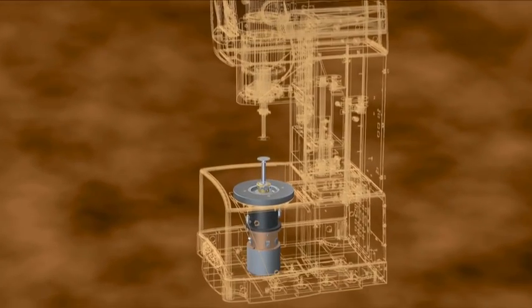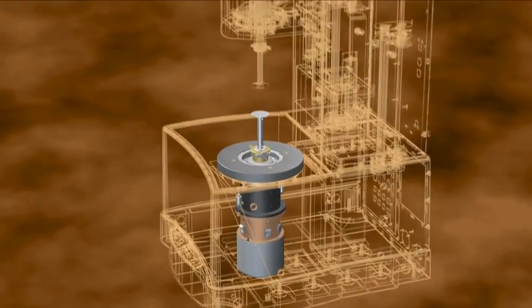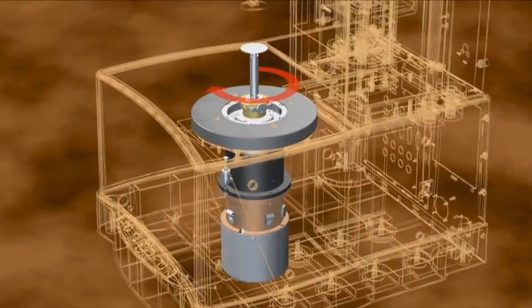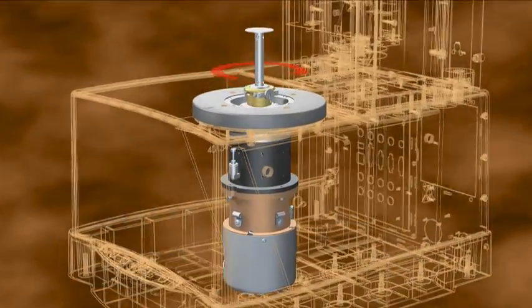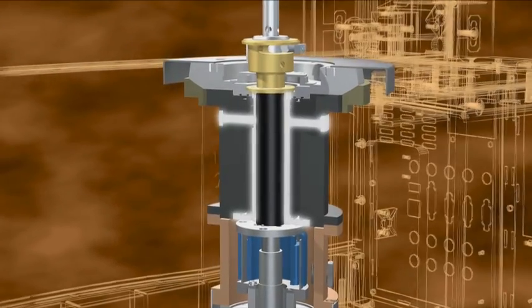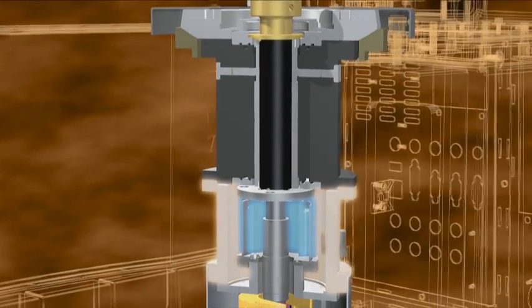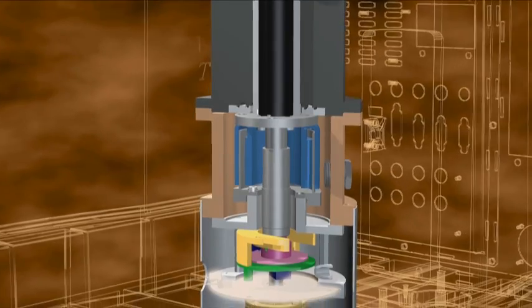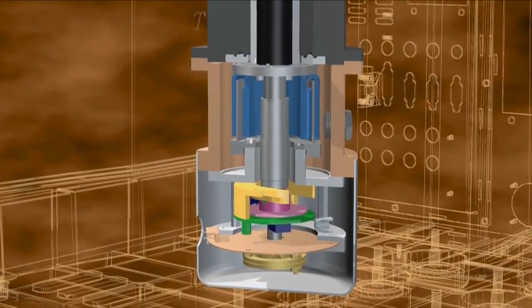The ARES G2 drive motor delivers the most accurate frictionless rotational motion over wide ranges of angular displacements and speeds. Key design components include air bearings, a brushless DC motor, patented non-contact temperature sensor, and an optical encoder.